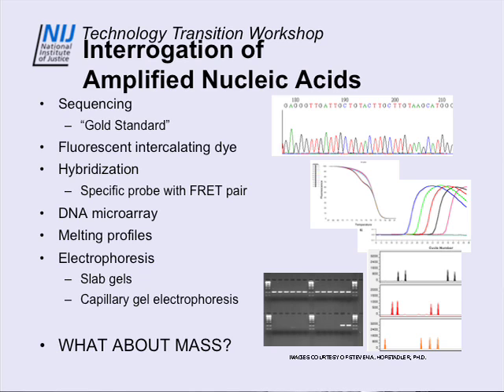As I described earlier, though, what about the mass? There's a lot of information inherent in the mass of a molecule. And as I described previously, from weighing this DNA, we can get a base composition. And that's our signature. That's our human forensic signature. That's our name, that bug signature in this application. That's our profile, that infectious agent signature.